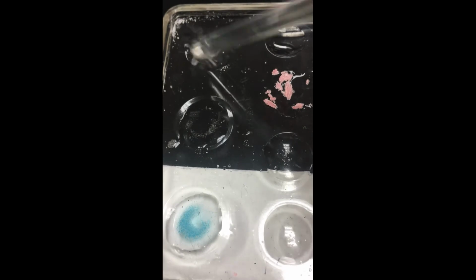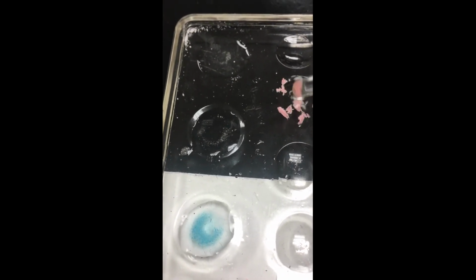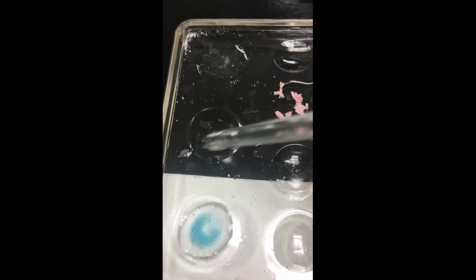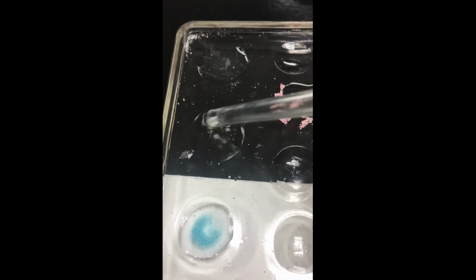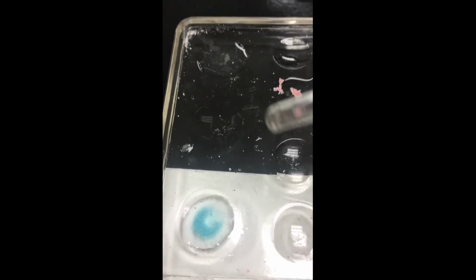If I keep stirring this, we can see we have less and less. So my sugar is dissolving, the wax is not, paraffin wax. The salt, we all know, does dissolve, so if I gave that a few more minutes, it's slowly going away. And here is my copper sulfate. And what's interesting about this is you can see the water starting to turn blue. That means it's definitely dissolving. It might not all dissolve, but a lot of it is dissolving. Actually, I might be able to get all of it to dissolve.